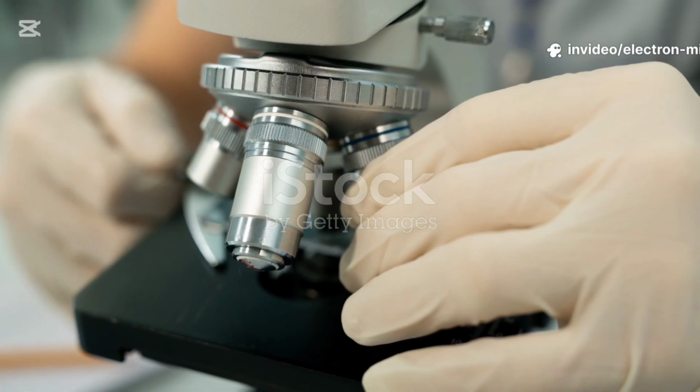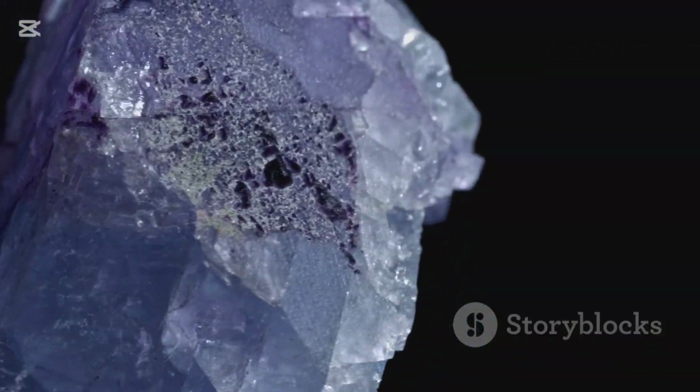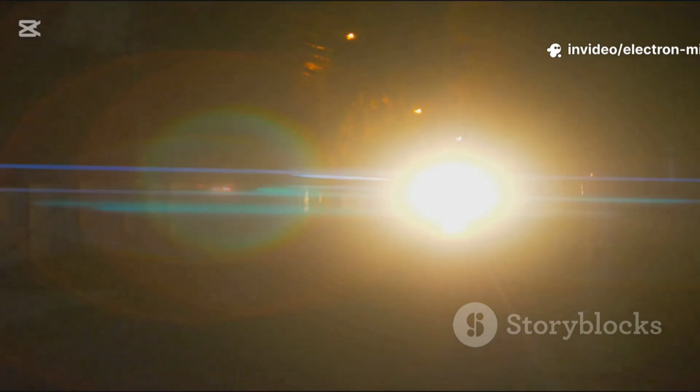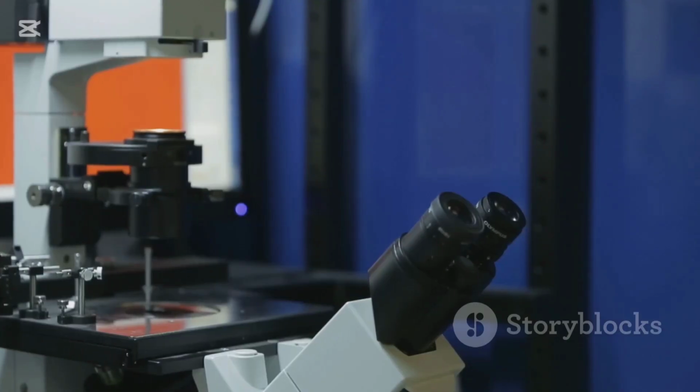When we talk about microscopes, two words matter: magnification and resolution. Magnification makes things look bigger. You can blow an image up endlessly, but without resolution, it's just a bigger blur. Resolution is clarity, the ability to tell two close points apart. Electrons have wavelengths thousands of times shorter than light, giving electron microscopes far greater resolving power.